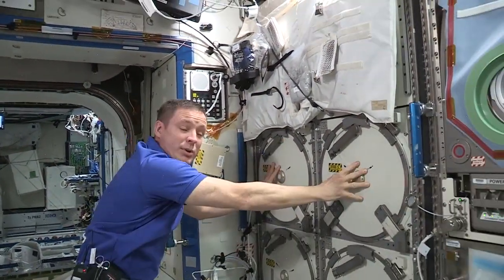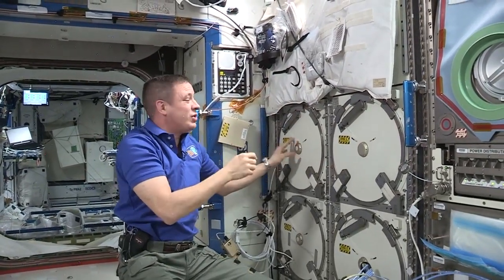There are four 75-liter chambers in each MELFI and we have three MELFIs. We have a bunch of little freezers too, but this is the big daddy.